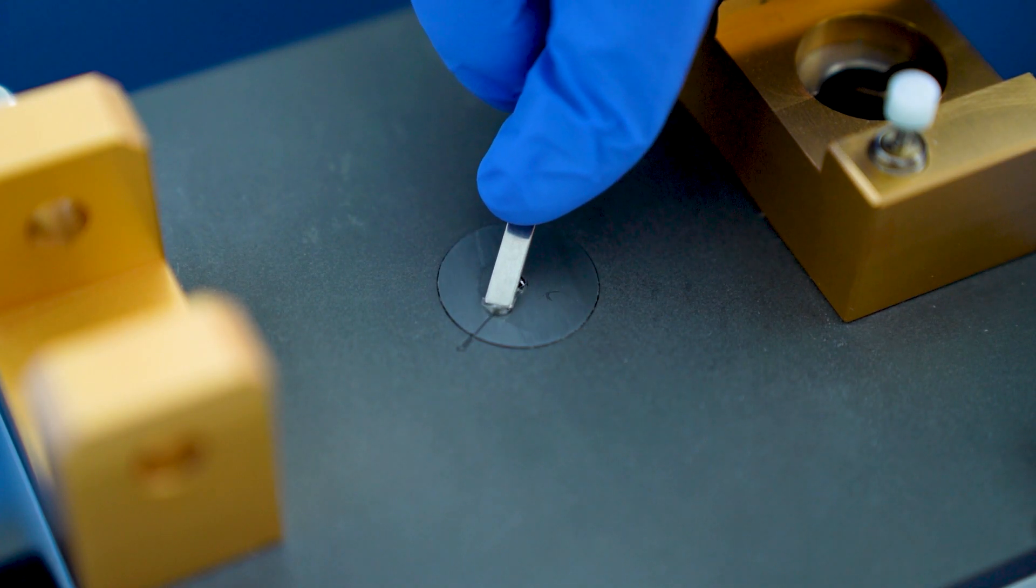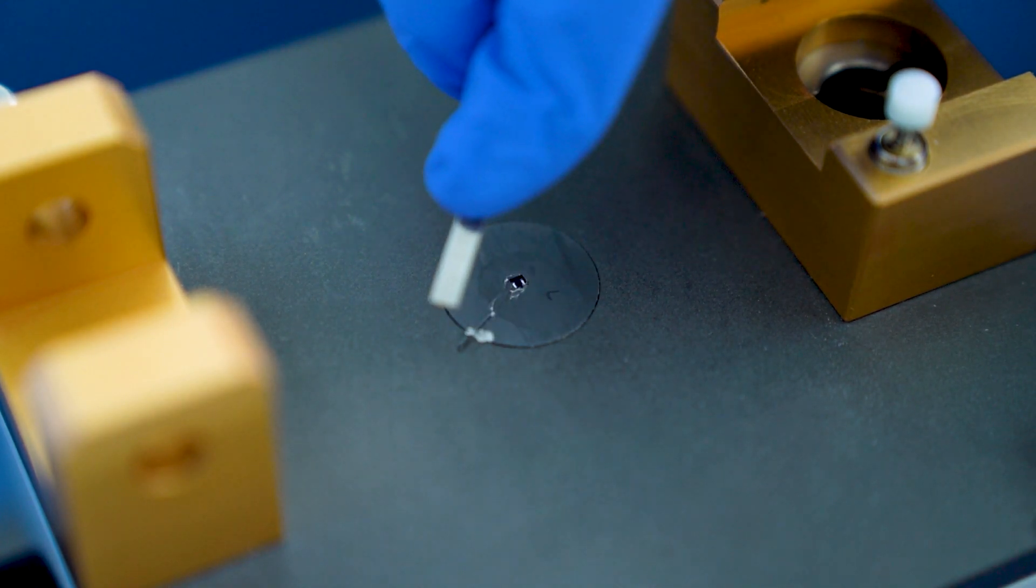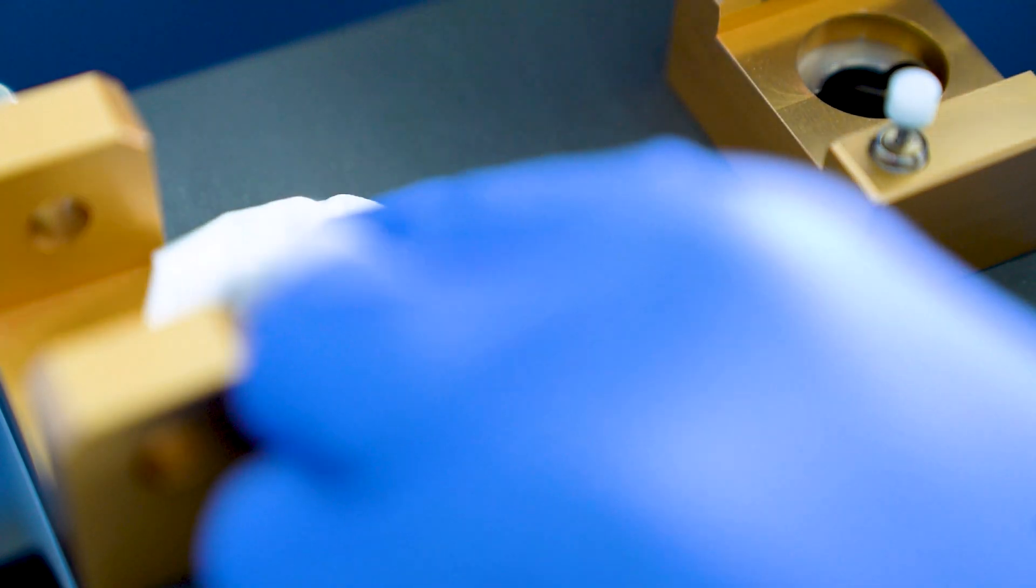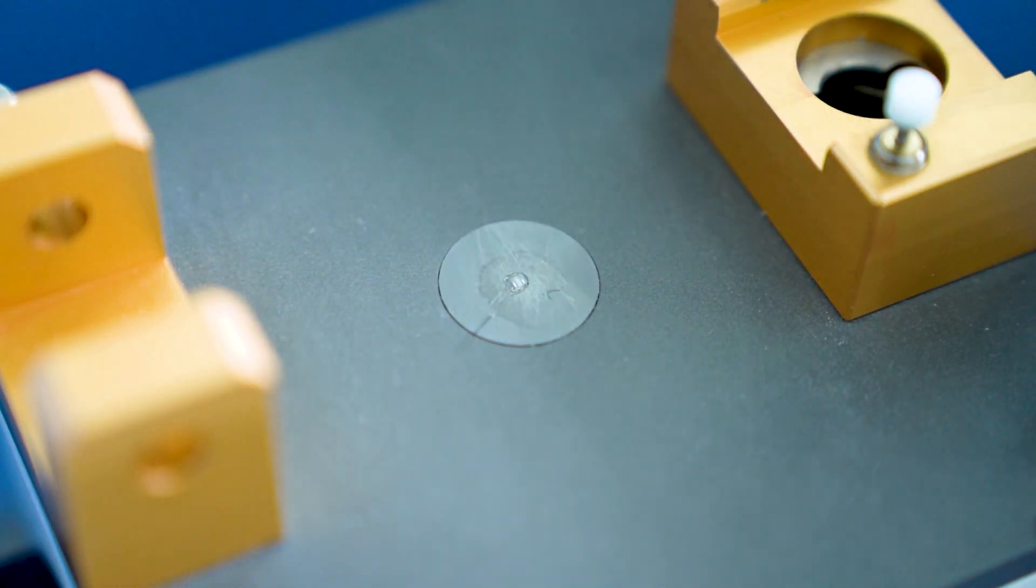After our experiment, we simply peel off the adhesive, remove residues with a bit of acetone, and are ready for the next one.